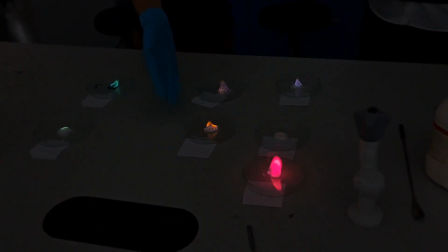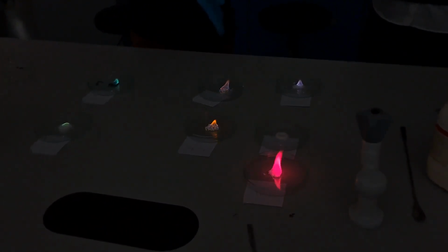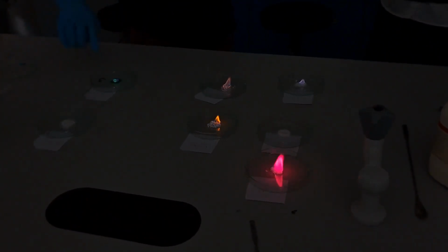This is calcium chloride and barium chloride from the same group. Boron is in group 3 and copper is a transition metal. Okay, we have homeroom, but let's not worry about that.